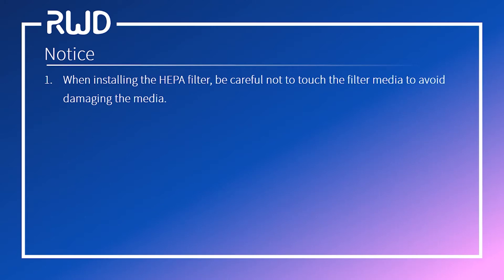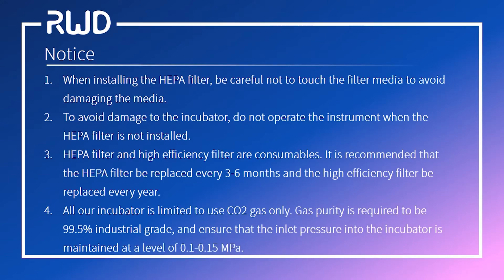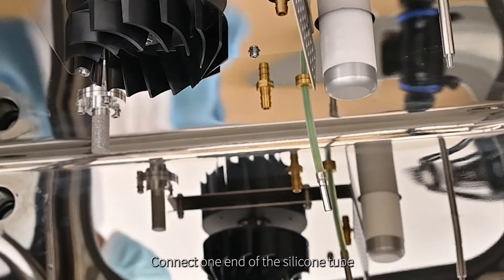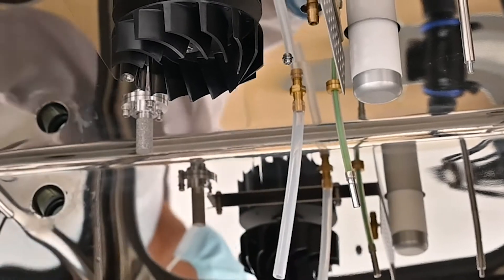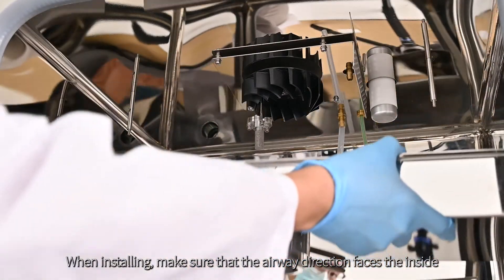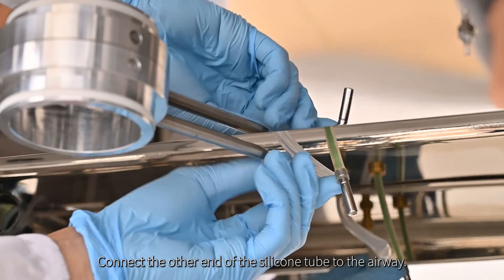Please pay attention to the following before installation. Install the rubber plug in the upper left corner of the tank. Connect one end of the silicone tube to the detection port in the incubator. Make the inner cover component pass through the two mounting posts above. When installing, make sure that the airway direction faces the inside. Unlock it with wing nuts. Connect the other end of the silicone tube to the airway.